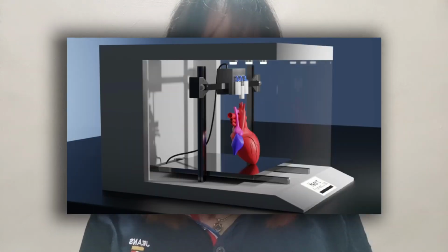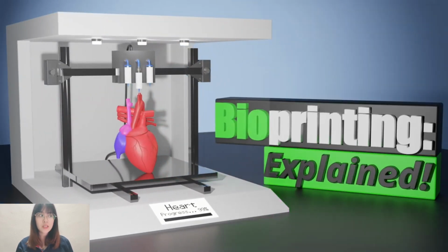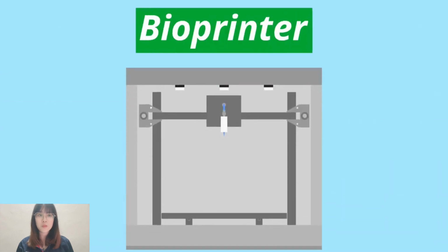So today let's find out about 3D bioprinting. 3D bioprinting is a relatively new technology that, in theory, can fabricate nearly any tissue or organ from scratch.